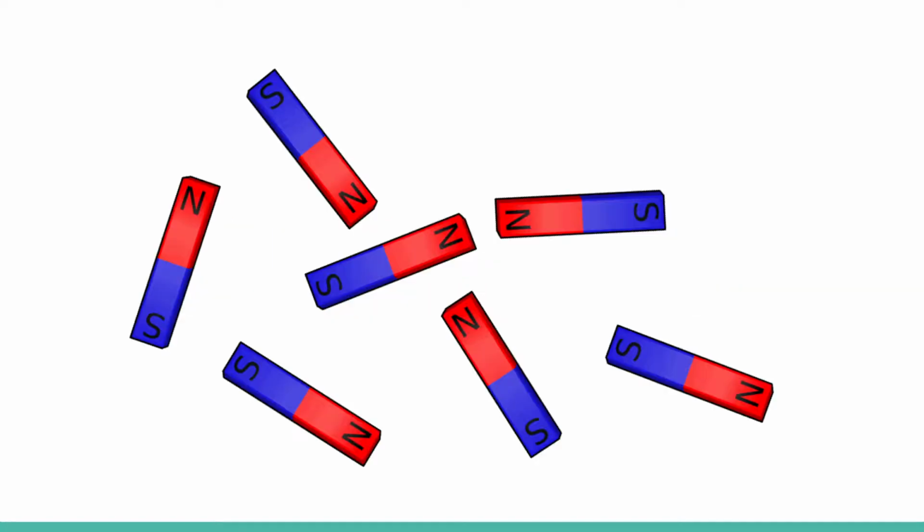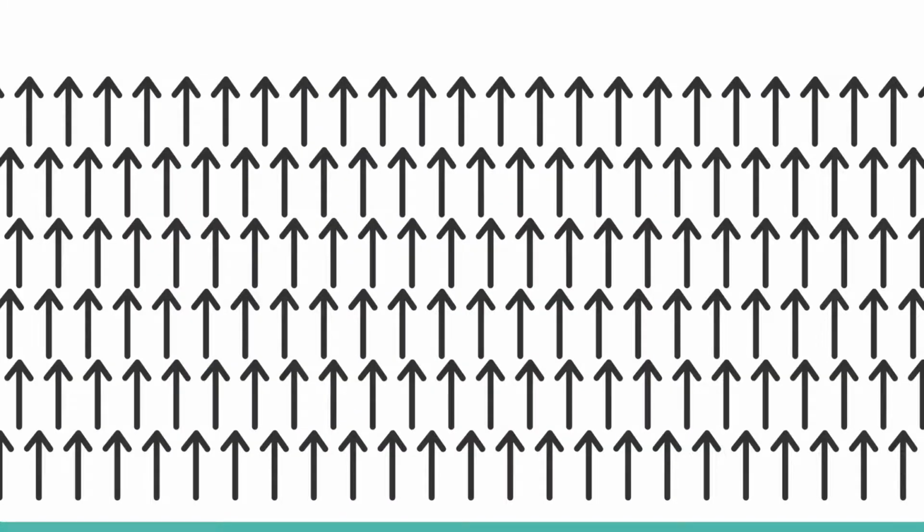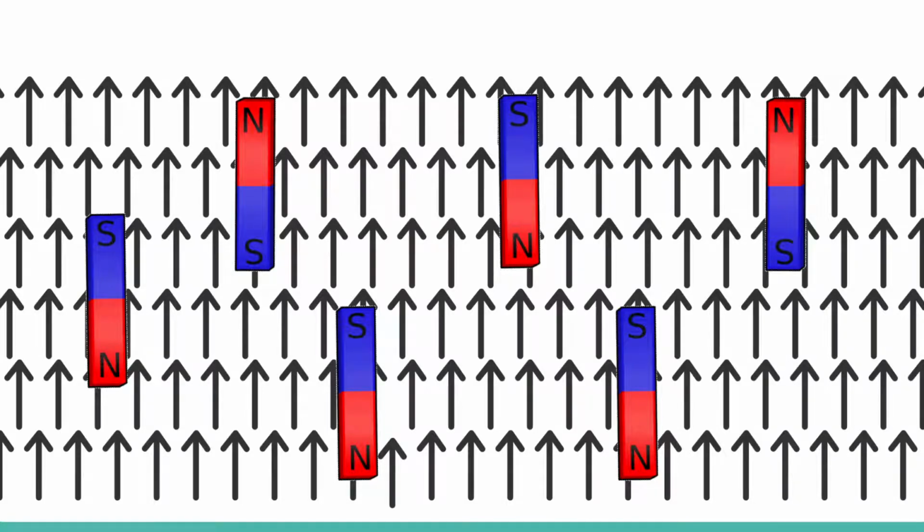To make it easy, I will be using magnets to represent the nucleus of an atom. Usually, NMR active atoms just float around in whatever way they like, just like the image shown. But when we put NMR active atoms into a magnetic field, which is shown by the arrows, the magnetic spins are aligned, like shown. These are called spin states. There are two spin states: against the field and with the field. Of course, against is higher energy and with is lower energy.